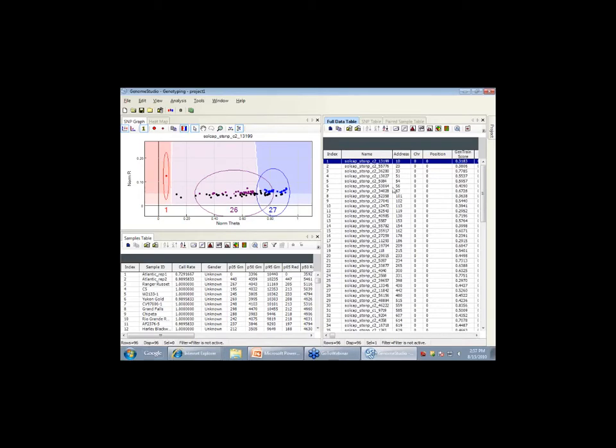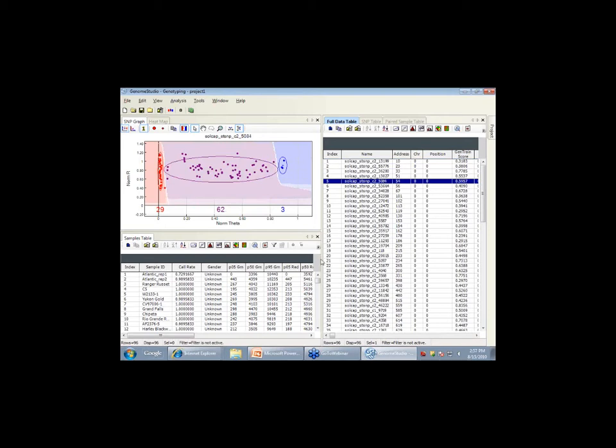And what you see graphically in the top left corner is the result of putting the SNPs and the samples together. You're seeing all the samples at once. It automatically tries to cluster the data based on what it sees. I'll walk through that, but you don't have to accept their algorithm. You can refine anything you like and make these clusters tighter, or say, I really know that the heterozygous class should be out here somewhere.